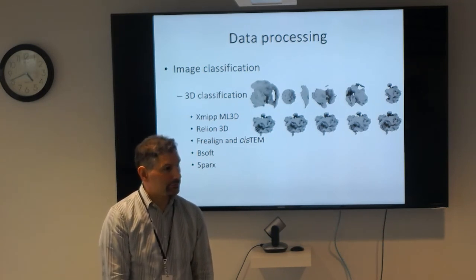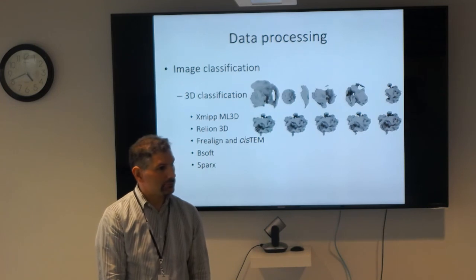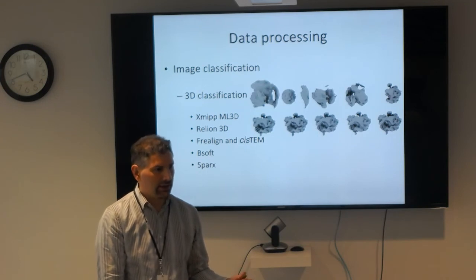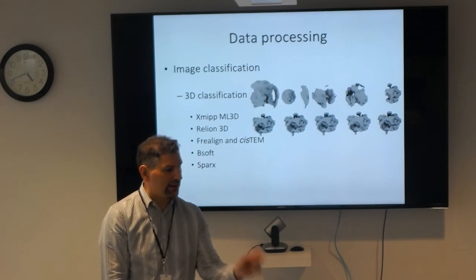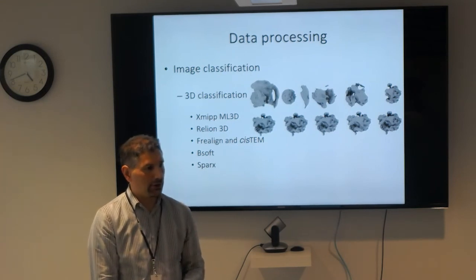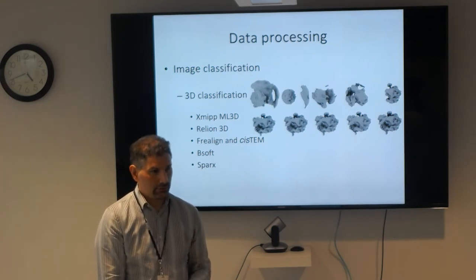Do you have to compensate for the difference in contrast, or will the programs automatically? I don't believe you have to compensate for the difference in contrast, because Relion does some scaling itself. Oh, okay, because you're looking at each particle itself, you're not looking at the entire micrograph. I think you're fine in that regard. I don't think you have to use special tricks.